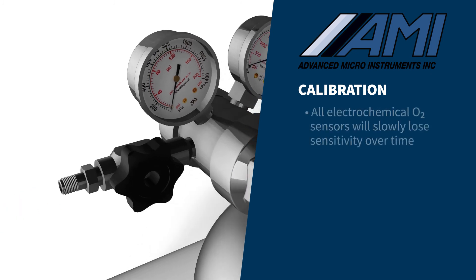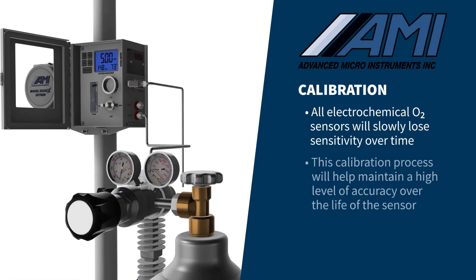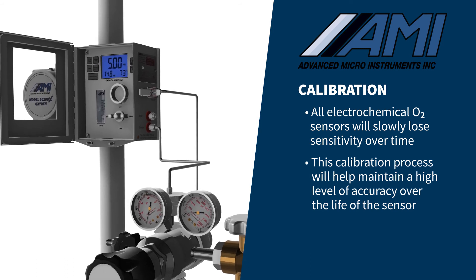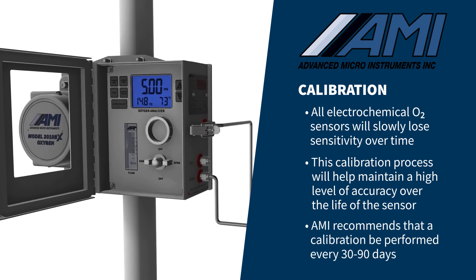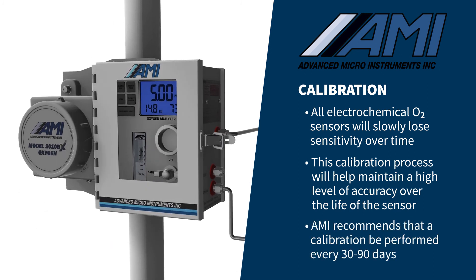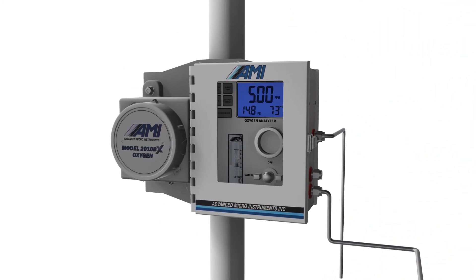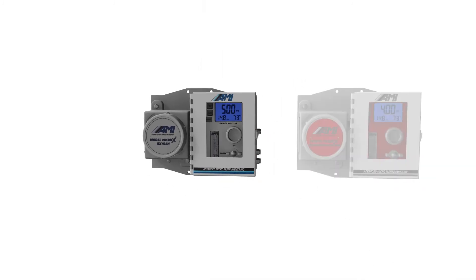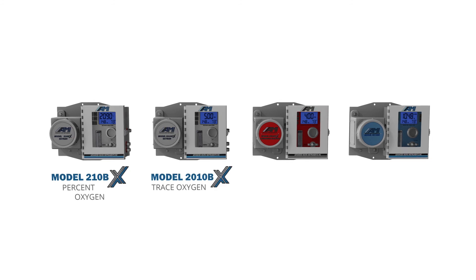All electrochemical oxygen sensors will slowly lose sensitivity over time. This fast and simple periodic gas calibration will maintain a high level of accuracy over the entire sensor life. AMI recommends a calibration be performed every 30 to 90 days depending on the oxygen concentration and upsets in your sample gas stream. Proper installation and calibration of AMI sensors will ensure the accuracy and long-term high performance that AMI analyzers are known for. Let AMI help you with all of your oxygen, hydrogen sulfide, and moisture analyzer needs.